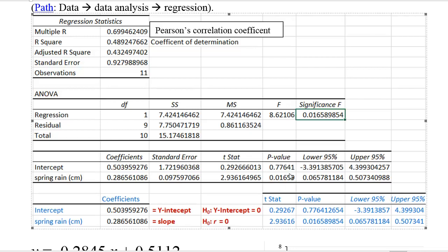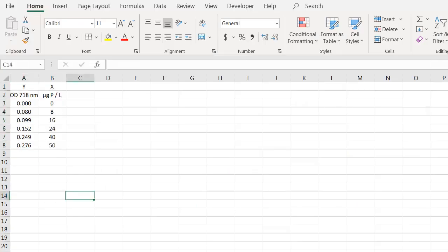Additionally, Excel will calculate confidence intervals for both the y-intercept, which is these two values right here, and the slope of the regression line. What I'd like to do here is to show you the steps involved in actually using Excel to do regression analysis. This is one way of doing this. I'm going to be using the data analysis tool pack.